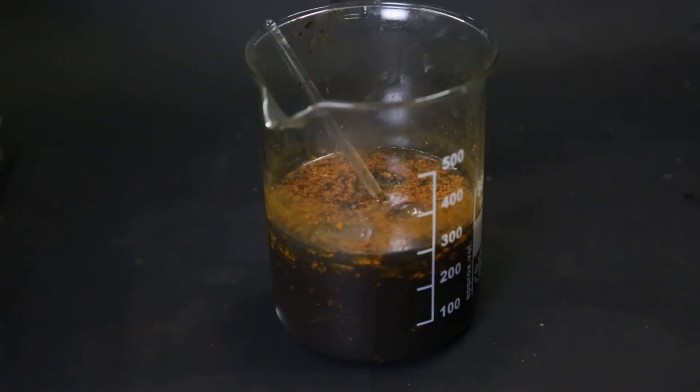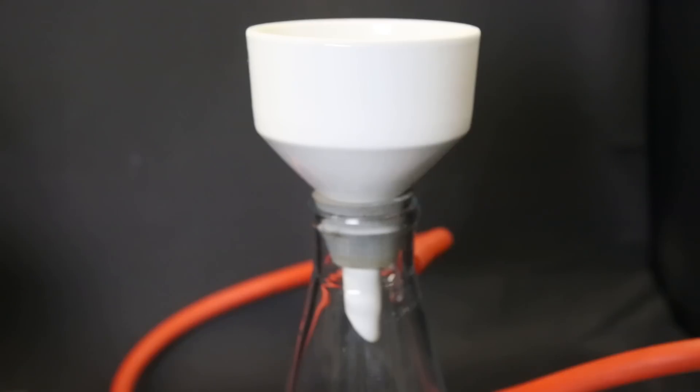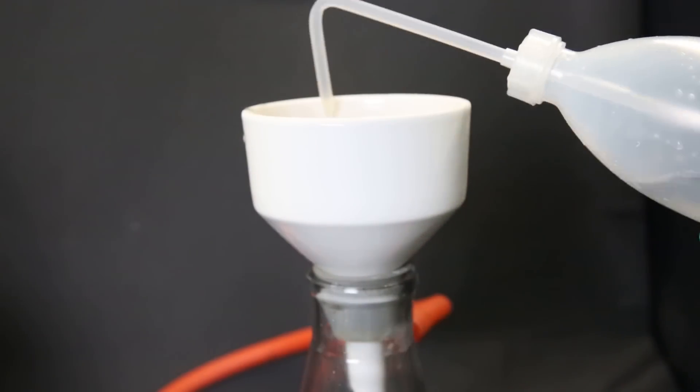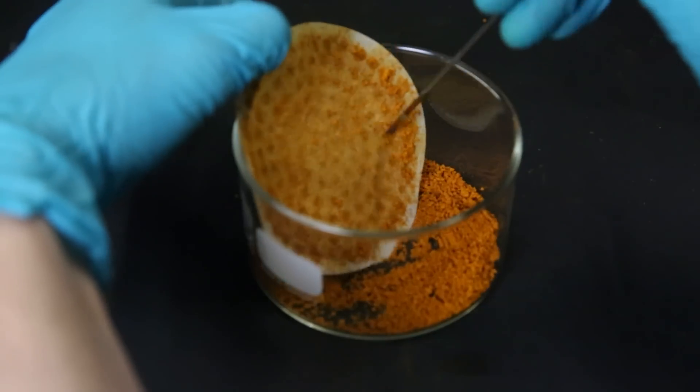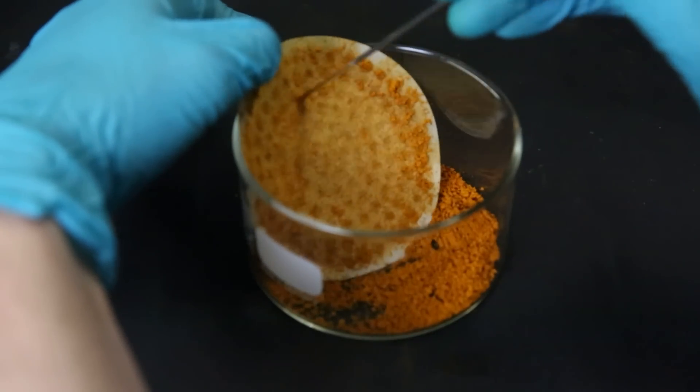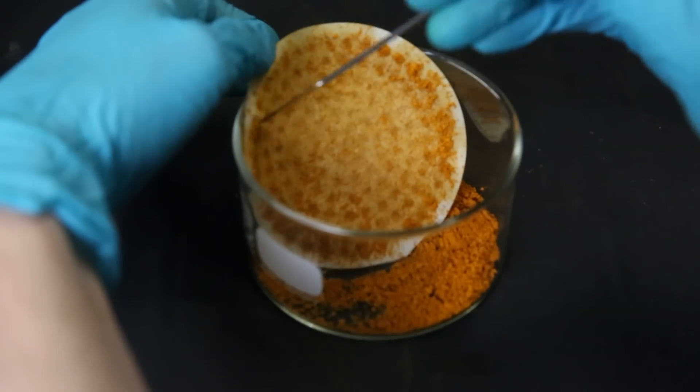Now the next step is to filter out the ferrocene, so I will simply use vacuum filtration. I wash the beaker a few times with some water and also wash the product on the filter with some more water. Afterward, I took out the filter with all of the ferrocene and scraped it all off into a crystallizing dish.